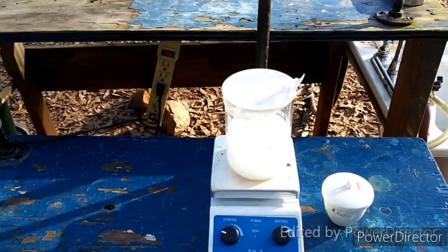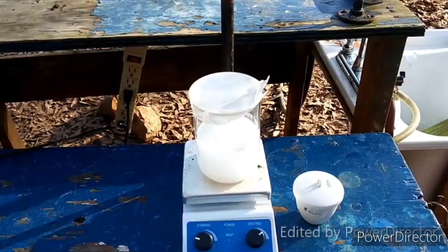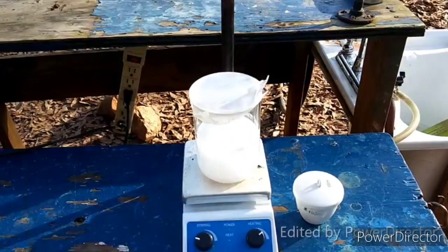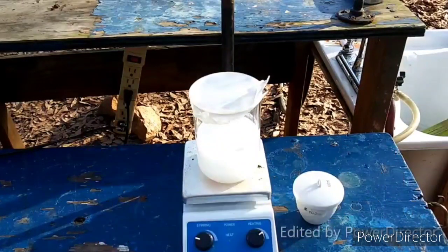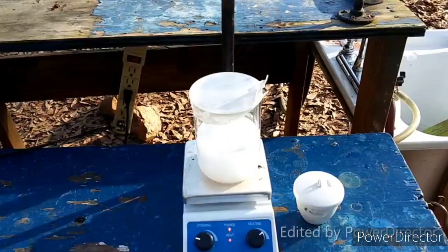Hello everybody and welcome back to the Poor Man's Chemist. In this video we are going to be making barium manganate using a very specific method I got from a paper about the use of barium manganate as an oxidizer in organic chemistry. Looking over this paper, this might be as awesome a discovery as the barium ruthenate oxidation, just for the sheer versatility and coolness of it.